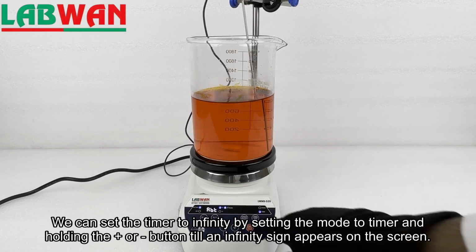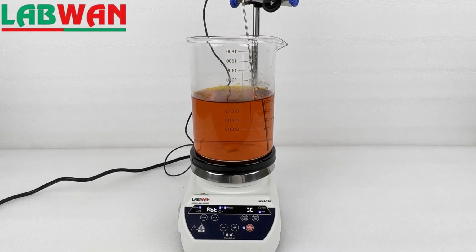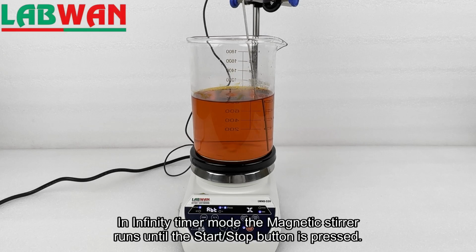We can set the timer to infinity by setting the mode to timer and holding the plus or minus button till an infinity sign appears on the screen. In infinity timer mode, the magnetic stirrer runs until the start, stop button is pressed.